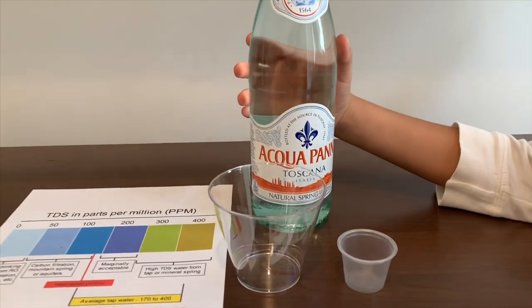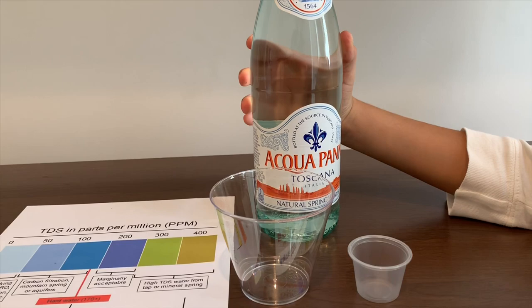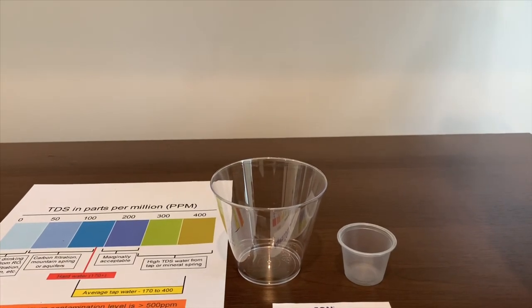This is Acquapanna, Toscana, Italy. It's natural spring water and it costs $2.29. Let's pour some in to see the TDS and pH levels.